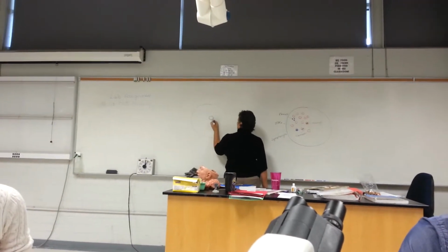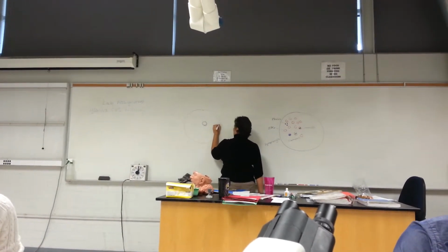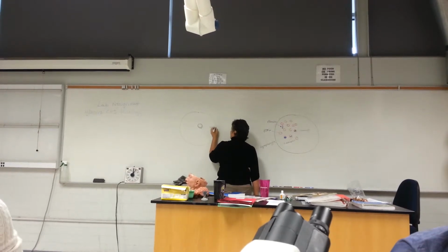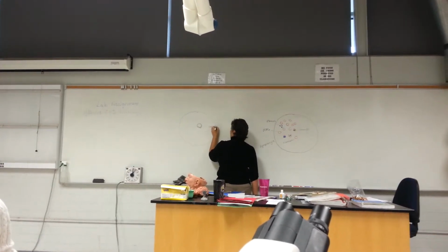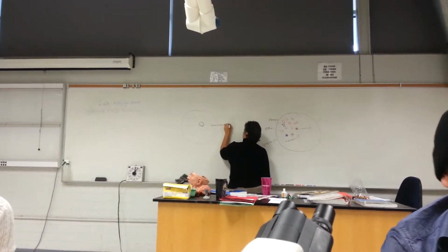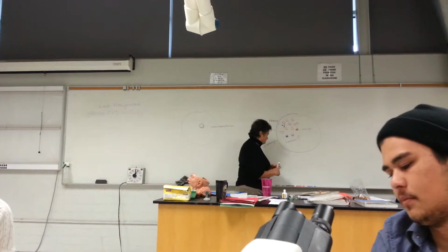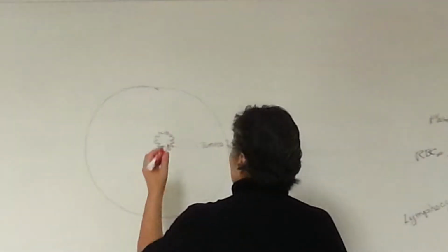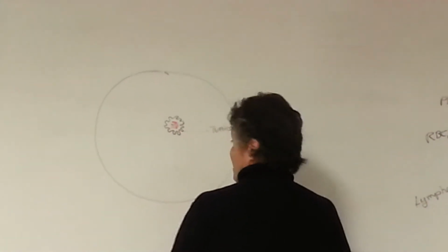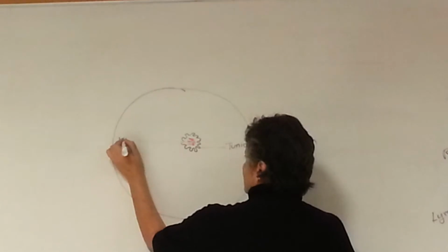So that's because it has a lot of elastic fiber, and that's because it has to withstand much more pressure than the vein. So that's the interna or intima, doesn't matter what you call it. What's this area in here? It's usually filled with blood. The what? Yeah. So it may or may not be filled with blood, depending on when they got it. So that's the lumen.